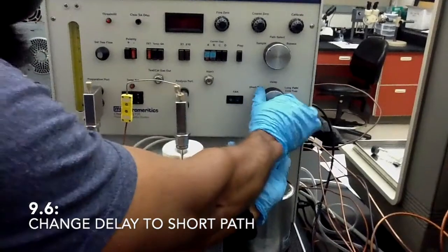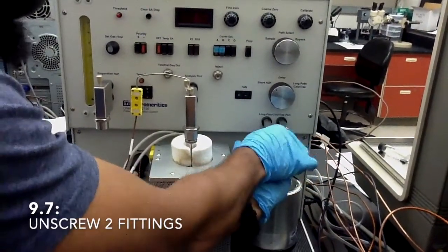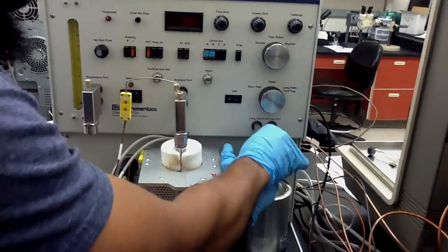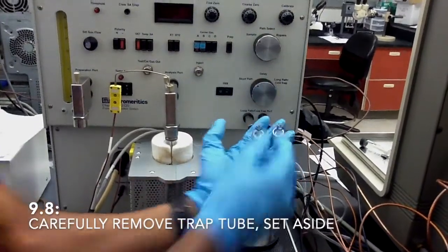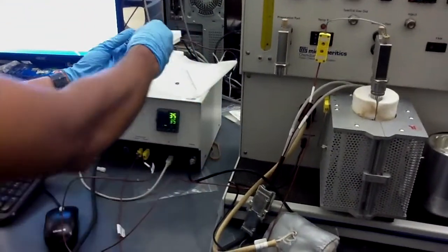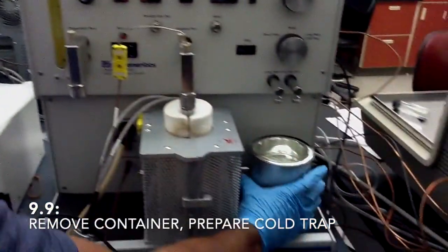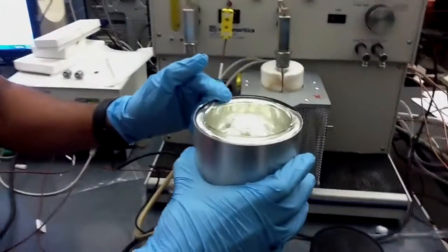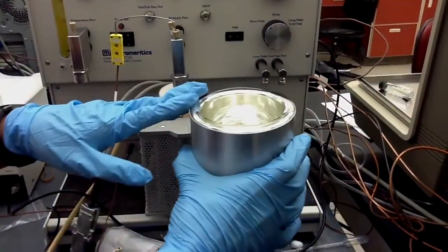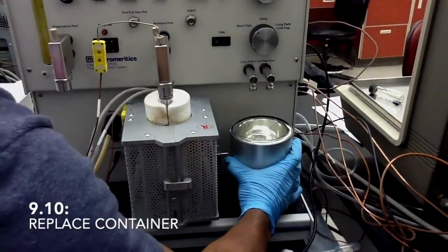Pull it up, take out this base from here, put it down here, put your finger or hand like this, and unscrew this tube fittings here. Once you open it, keep it aside like this, and then you prepare your cold trap with isopropyl alcohol and liquid nitrogen. Since we already have this one prepared, I am not going to show how to do that.